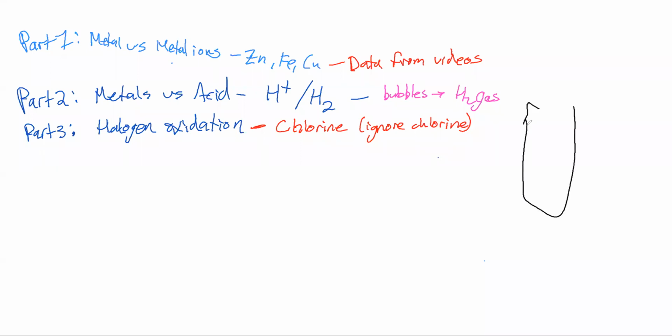so in your test tube, when they first mix them together, you'll see two solutions that they make. Generally, there'll be a solution down here, and then there's one in the hexane. Now, that bottom color is kind of hard to see sometimes, and so really what we want to be looking at is the one in the hexane, right? So this one up here. Now, bromine by itself is kind of like this yellowish orange color. And so we'll see that when it's Br2.